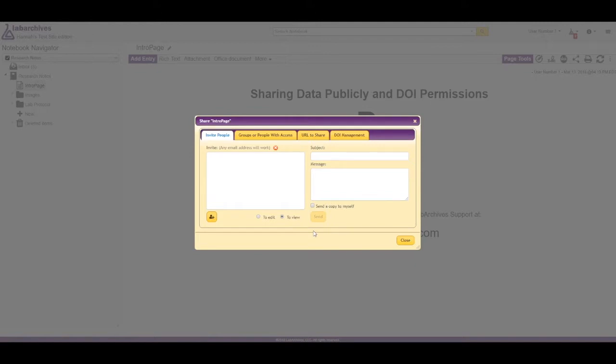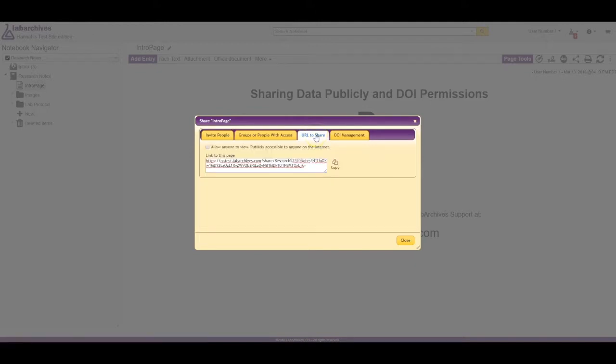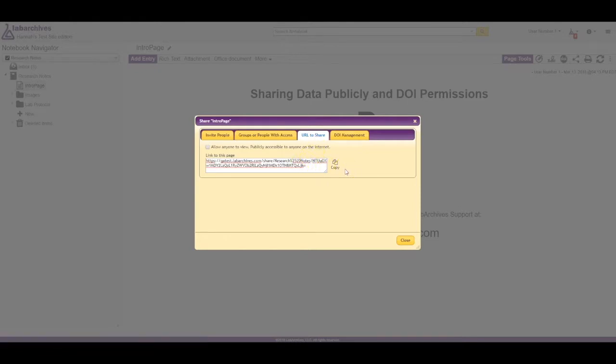On the URL to share tab of the share dialog, you will see a link like this. You could copy and paste this link into an email, and if someone has access to this data, they can follow this link to view this part of the notebook.